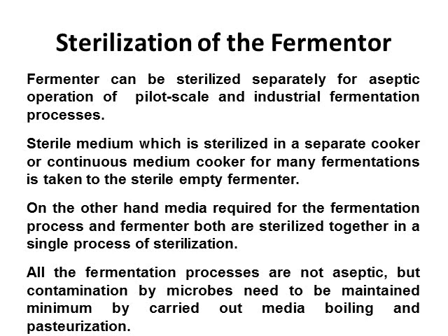Sterilization of the fermenter. The fermenter can be sterilized separately, for aseptic operation of pilot scale and industrial fermentation processes. Sterile medium, which is sterilized in a separate cooker or continuous medium cooker for many fermentations, is taken to the sterile empty fermenter. On the other hand, media required for the fermentation process and the fermenter can both be sterilized together, in a single process of sterilization.